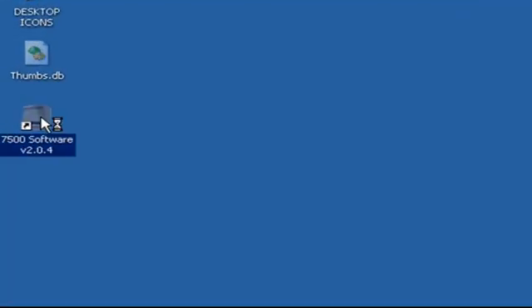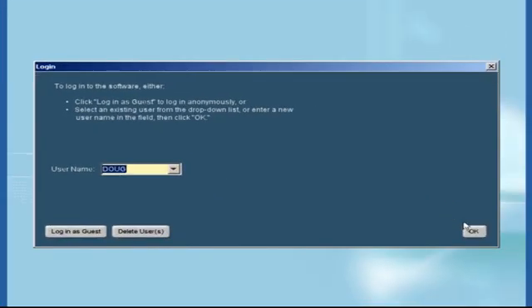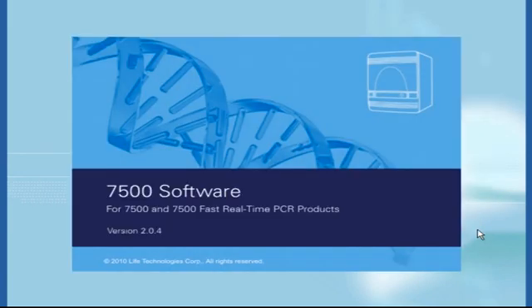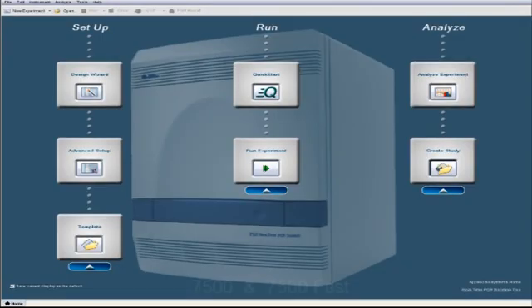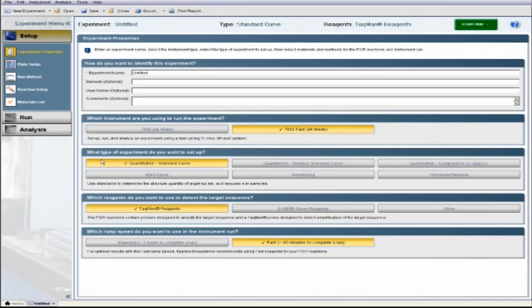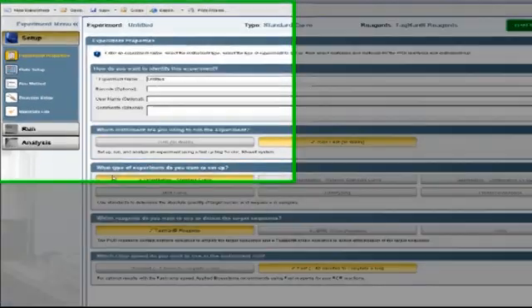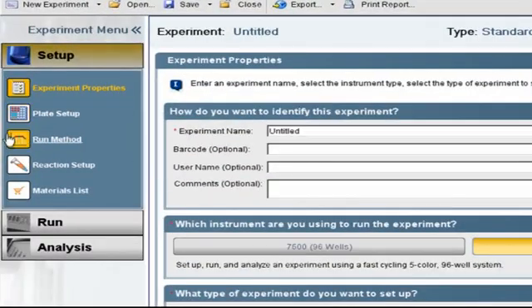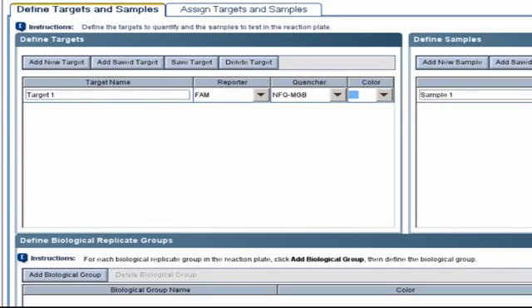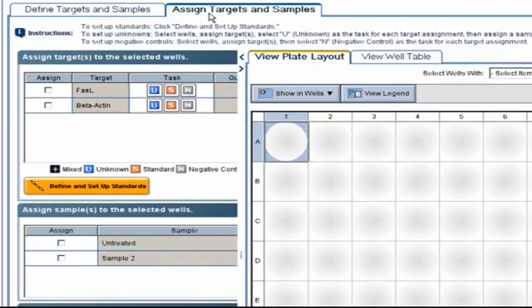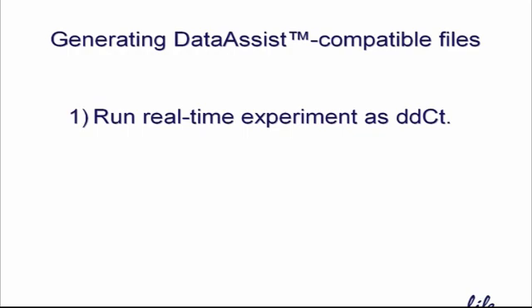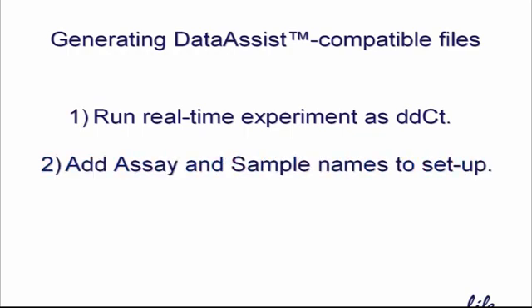I won't cover the setup procedure in detail for the StepOne and 7500 family of instruments, since the newest software versions are so similar to the VS7. But I will mention two small differences. First, you'll want to click on Advanced Setup from the home screen to kick things off. Second, when it comes time to add assay and sample names to specific wells, you'll find that there is no Assign listed under the Experiment menu. Instead, after you create target and sample names, you'll need to click on the Assign Targets and Samples tab. From that point on, the procedure is essentially the same as on the VS7. Just remember, regardless of what real-time instrument you're using, always select Delta Delta CT as the experiment type, and add both assay and sample names to the wells.